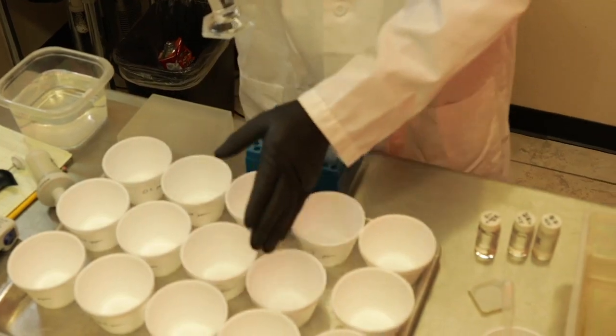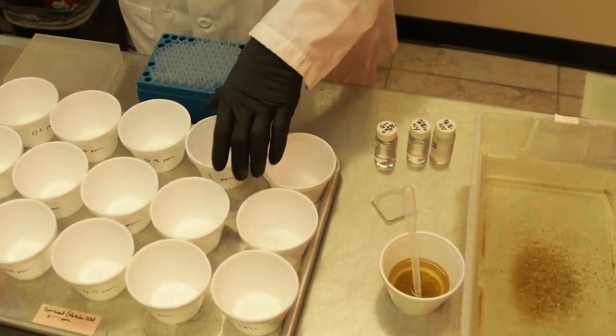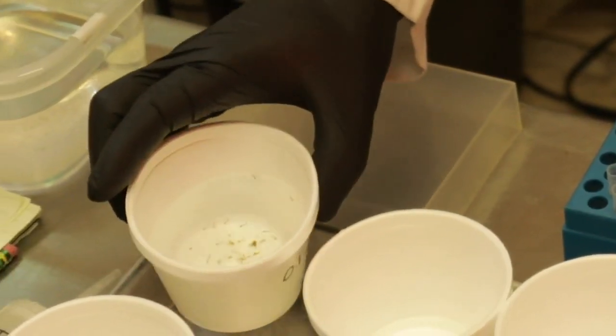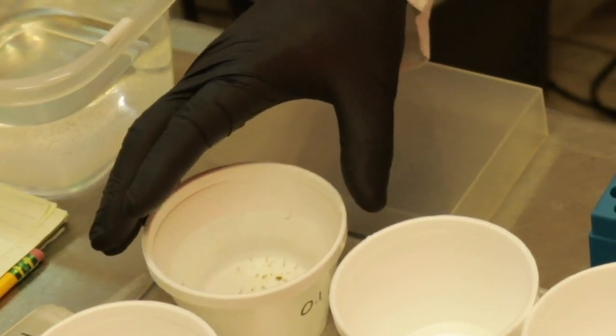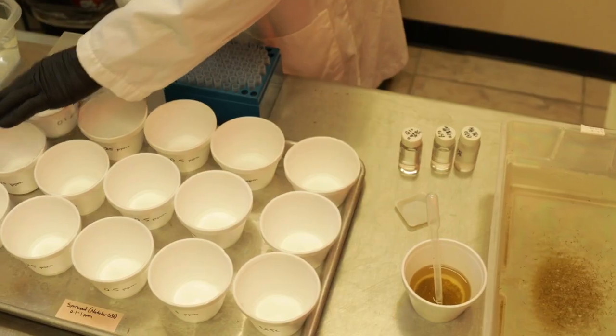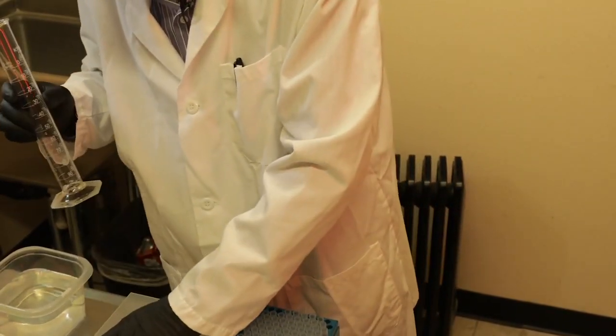You want to have a minimum of 3 replicate cups for each concentration in the bioassay, including the untreated control. You can use additional replicate cups if you have an adequate supply of larvae which have been raised under the same conditions. The more replicate cups that you use, the more robust are the findings in your bioassay test.